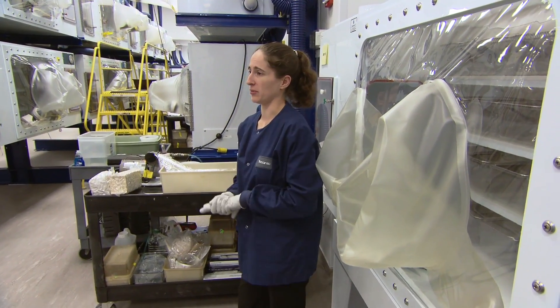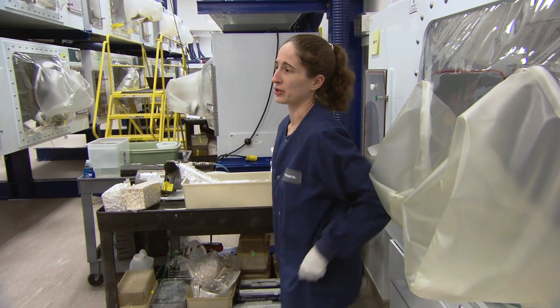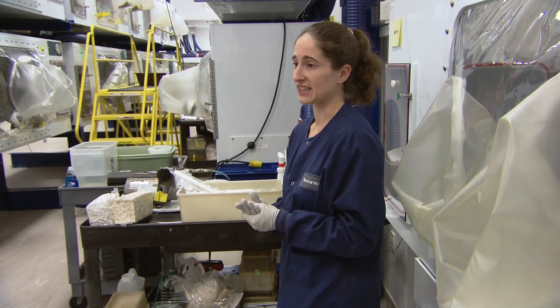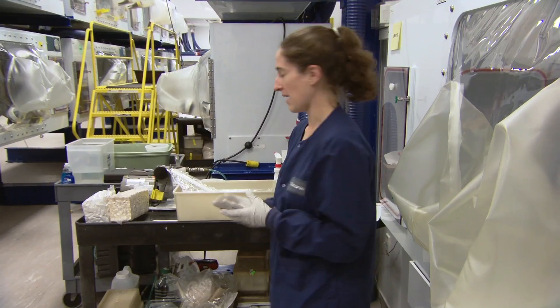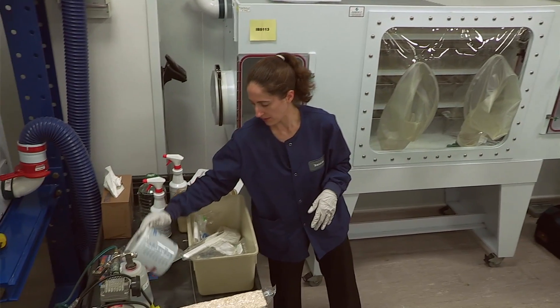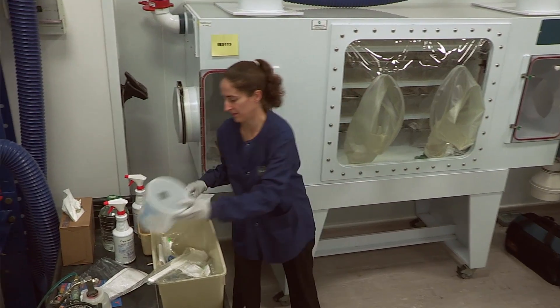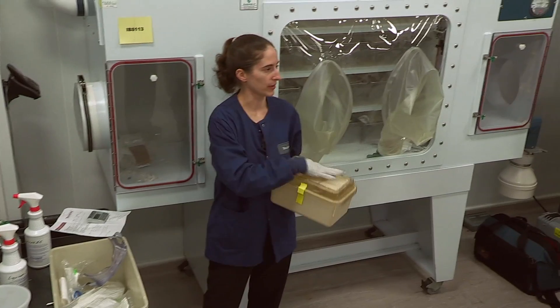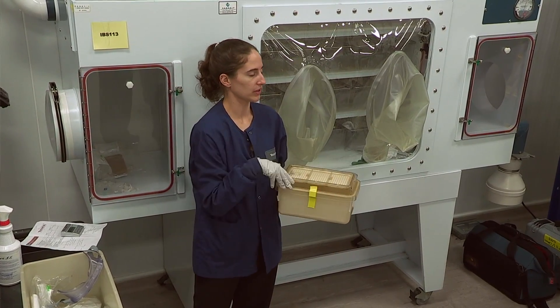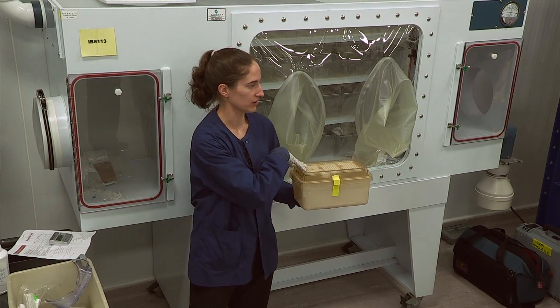The germ-free shipper is really the best way to get your animals into the isolator. If you didn't have one available or were transferring animals within your facility, what you would want to do is do a transfer within a biosafety cabinet. You could use something like a Nalgene-type container or a cage with a micro-isolator lid — autoclave it in a breather bag, spray it into a hood, take it out, and very quickly do the transfer.